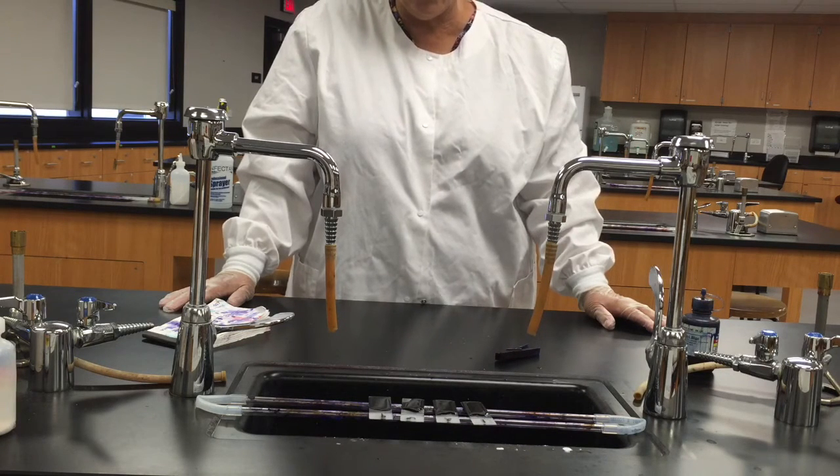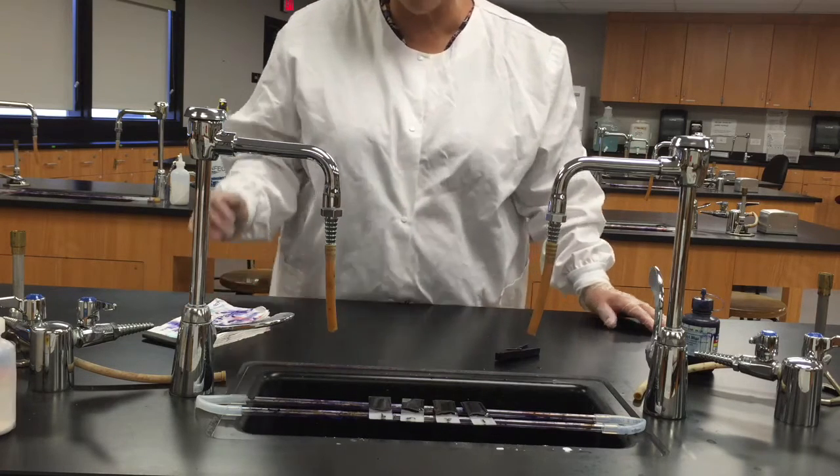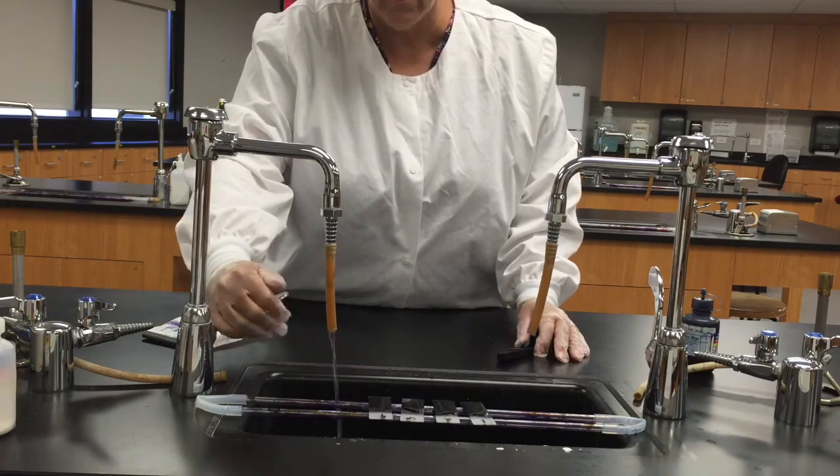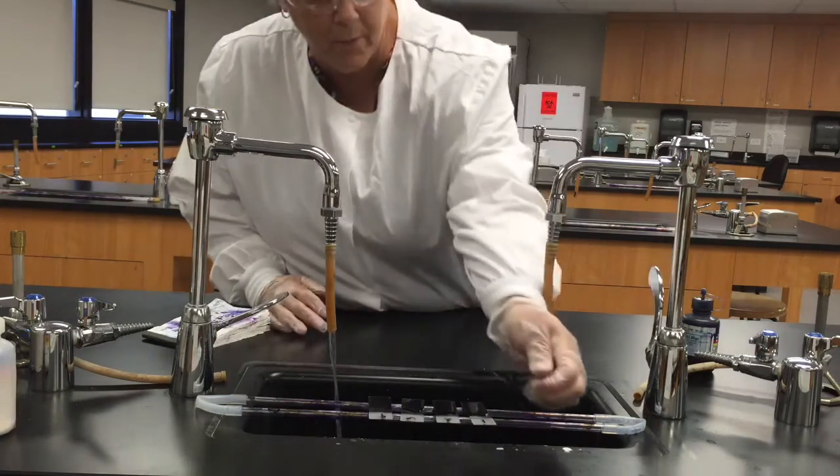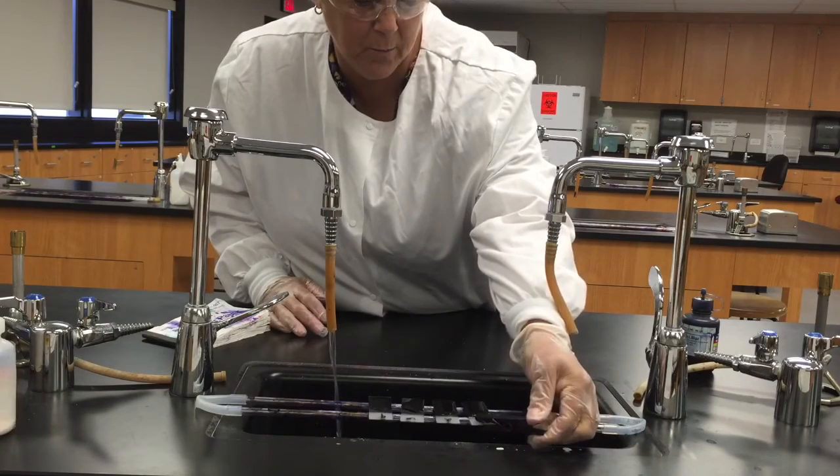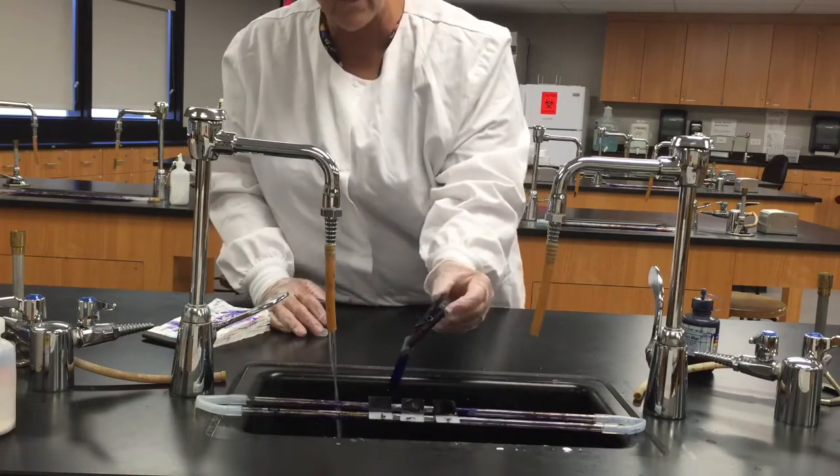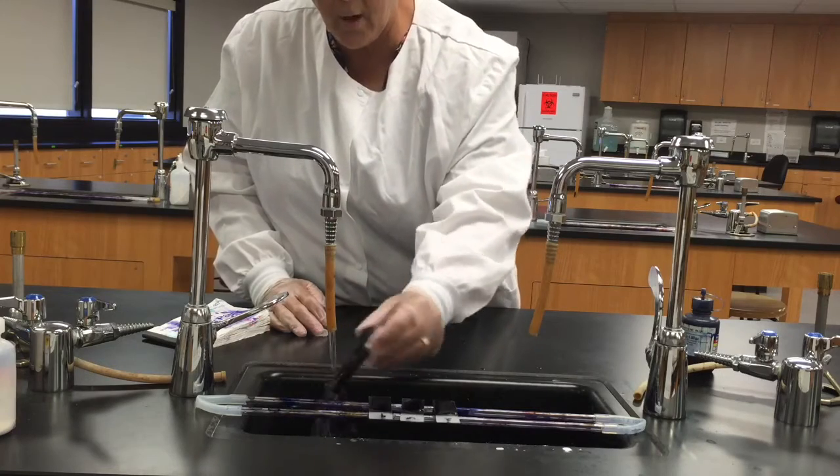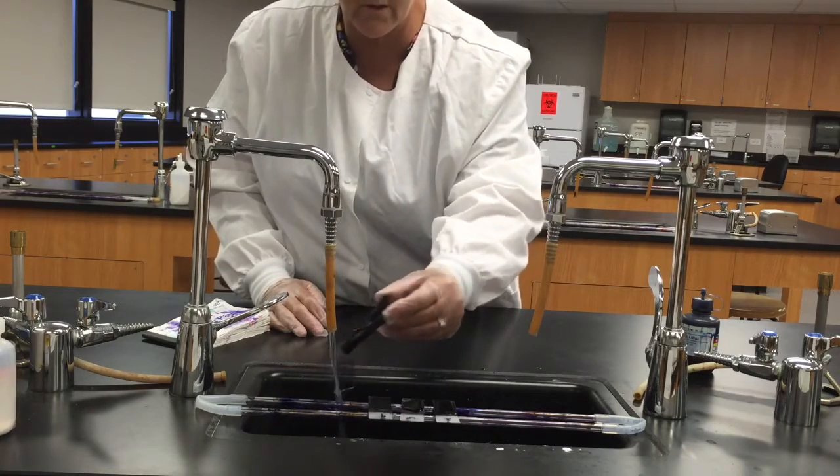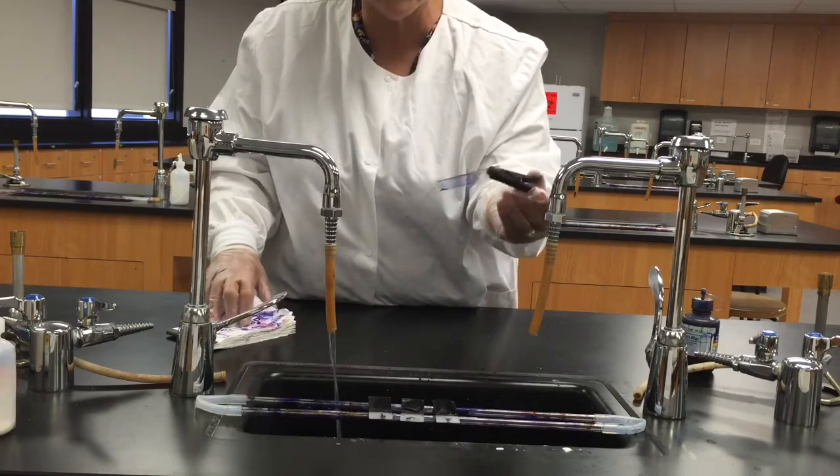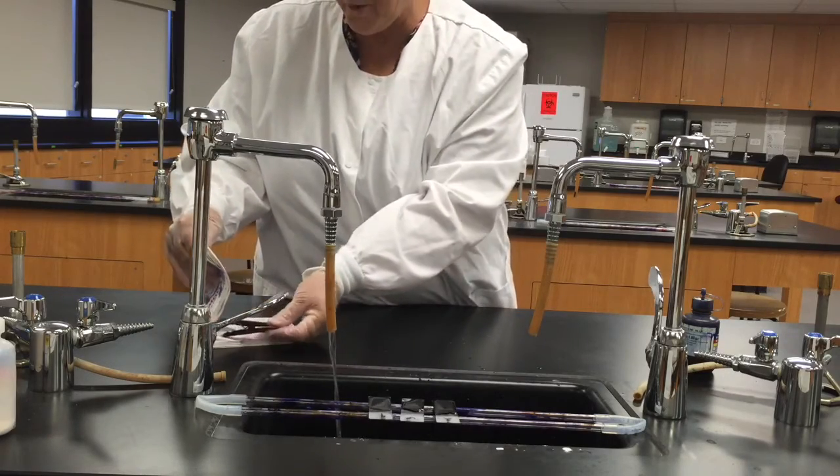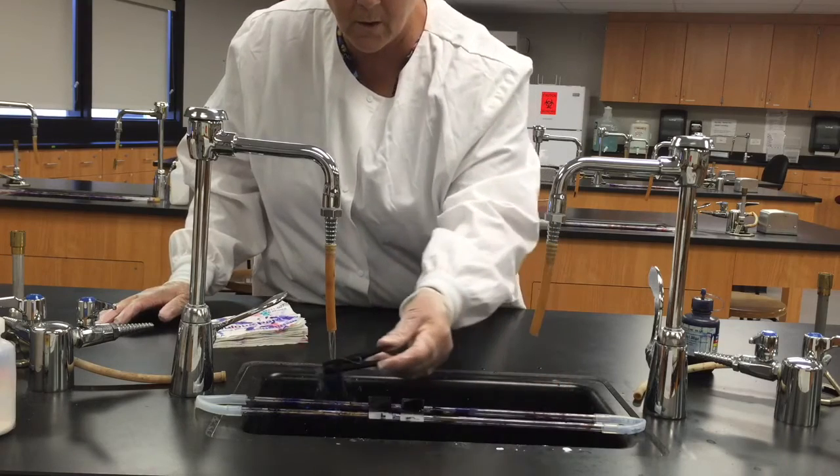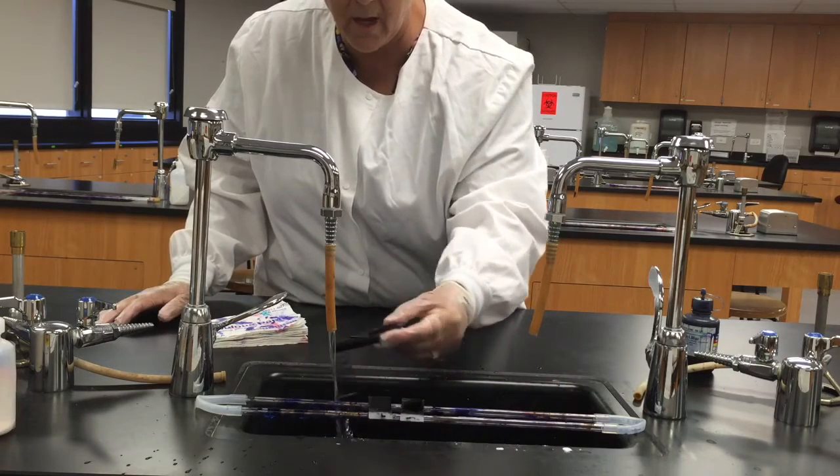All right, so the stain has been on the slides for a minute, what I'm going to do now is turn the water on kind of carefully, and I'm going to pick the slides up with my clothespin one at a time, let the stain drain off the slide, and give them a quick rinse. Now I'm most certainly not trying to rinse everything off of the slide, just the excess stain. And then I will place the slides in my bibulous paper, so I'm just going to go ahead and assembly line it here.